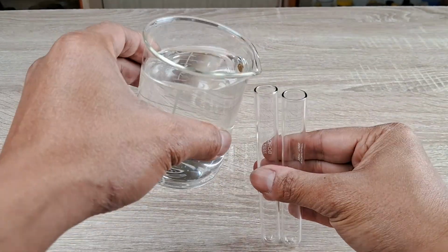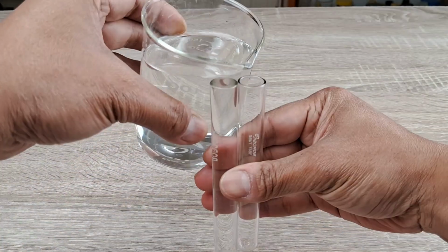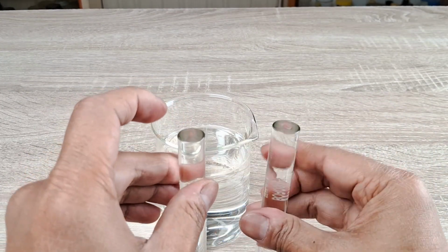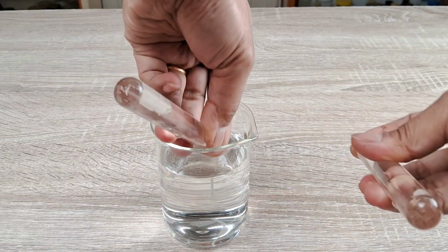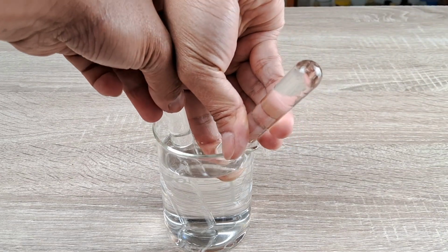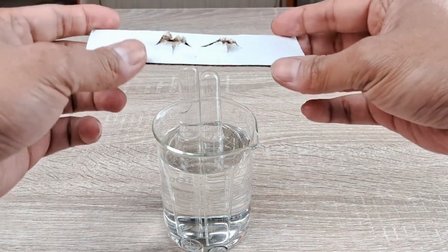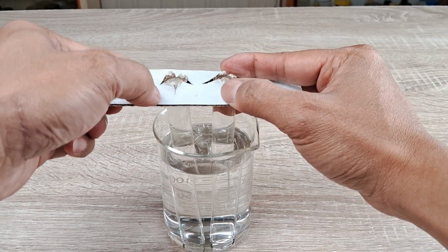Fill 2 test tubes to their brims with the same acidified water from the beaker. Cover the mouths of the tubes with your 2 thumbs or fingers and immerse the tubes upside down in the beaker. You can also support the tubes using a sheet of cardboard with 2 holes as shown here.